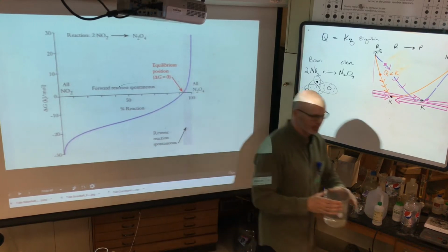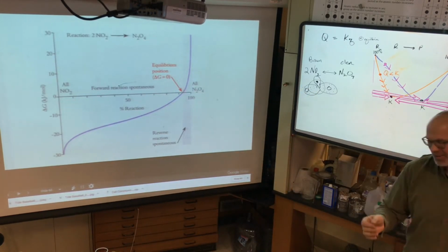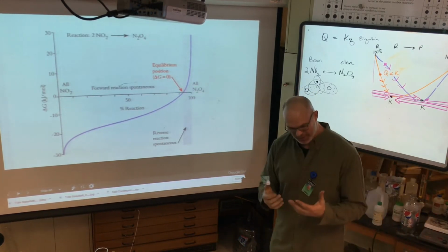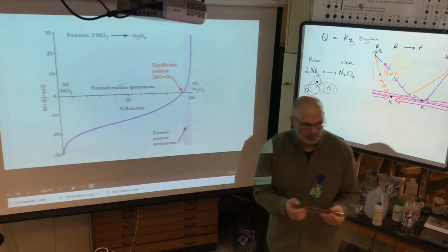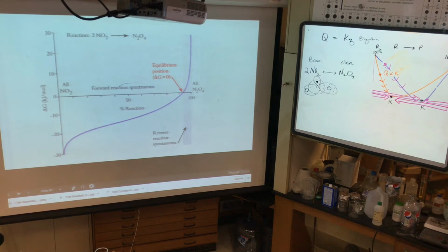Okay. Hey, it's all good. Oh my gosh, the skin came off. Okay, no. Let's put, slowly, one of these into the hot water. I don't want to do it too fast because it's probably tempered, I forget. All right? But I'm just putting this in hot water.